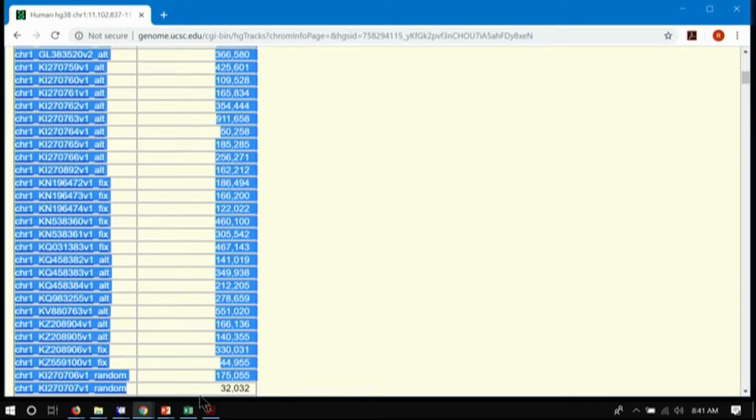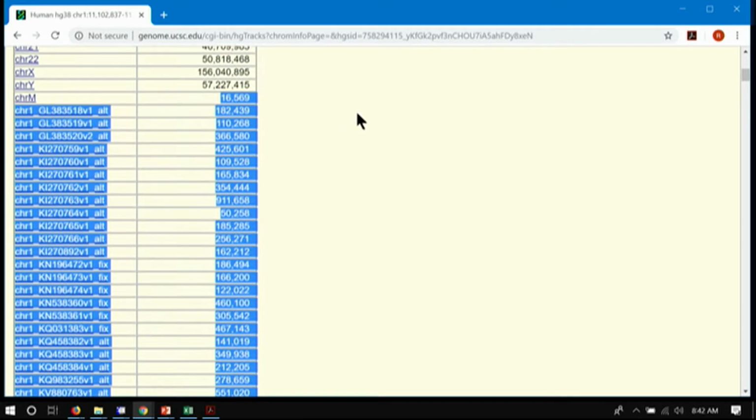Those are places where the consortium has made some changes in the reference, or the alts were in the original reference, but it changed. There were places that are fairly variable in the human population, and so they gave you alternate versions of particular chunks of the chromosome. You can see they aren't very big. On chromosome 6, there are a few that are 5 megabases, but most of them are under a megabase. But the MHC and HLA regions that are immunologically relevant are highly variable. And so they've been in the genome for a while as alt sequences.